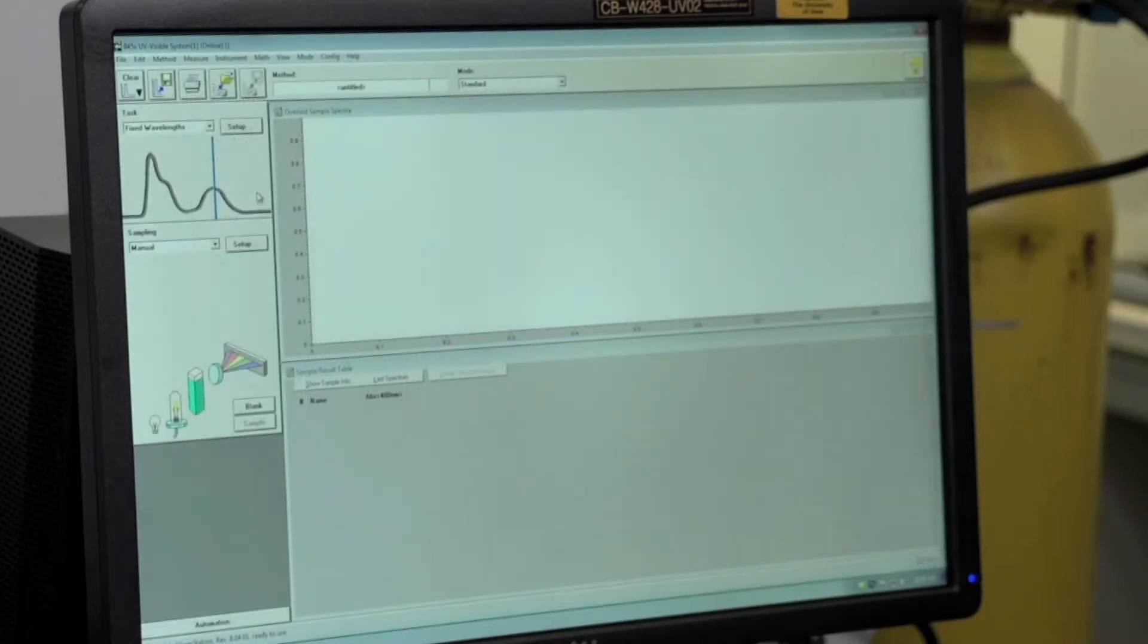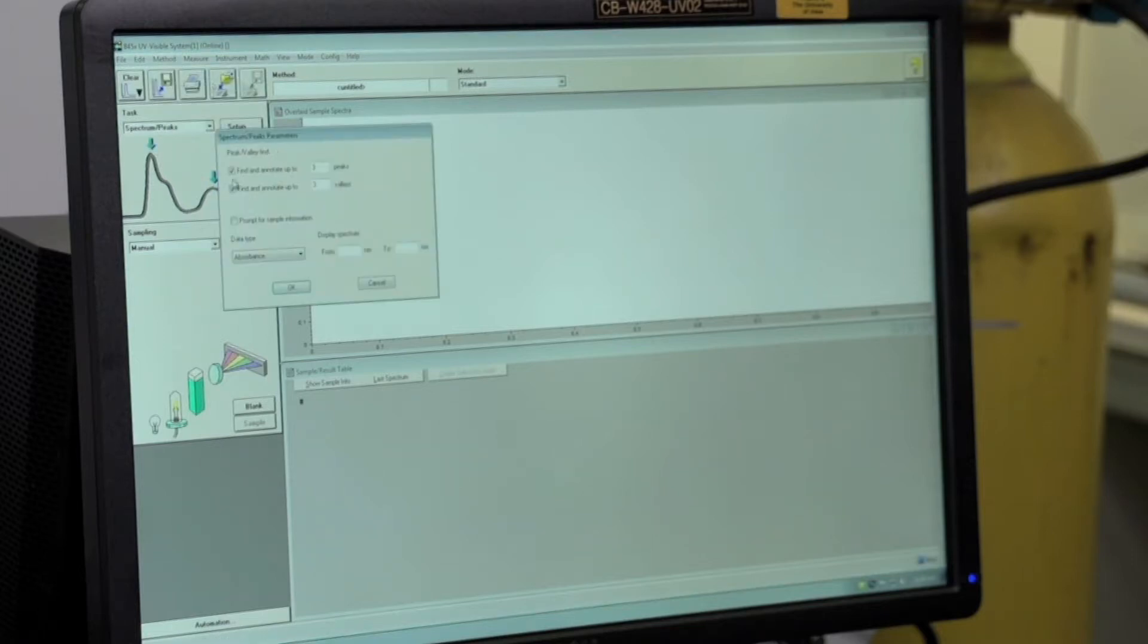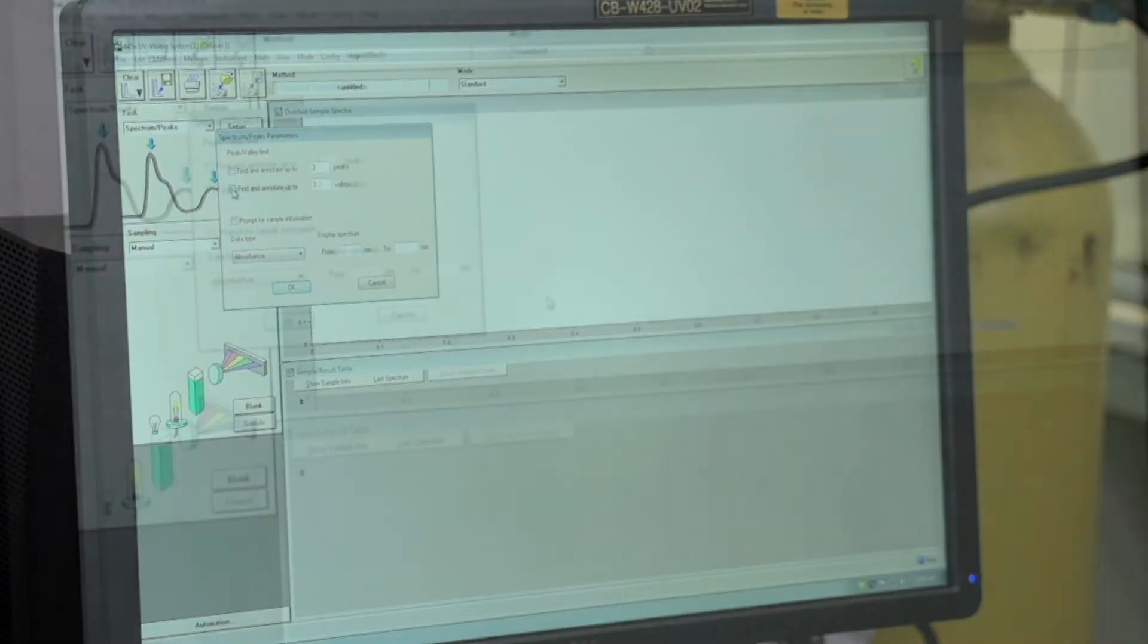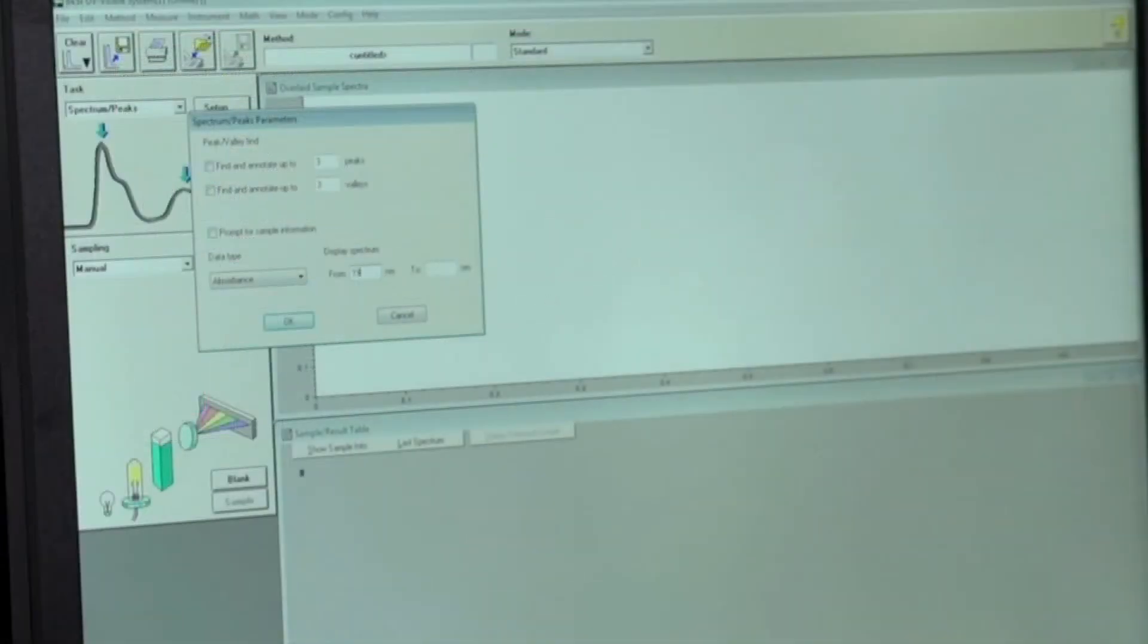To ensure that the instrument program is set up correctly, we will need to go to method and then select spectrum peaks to measure the full spectrum. And then we'll want to uncheck valley and peaks and then display the spectrum from 190 to 1100 nanometers. And then select OK.